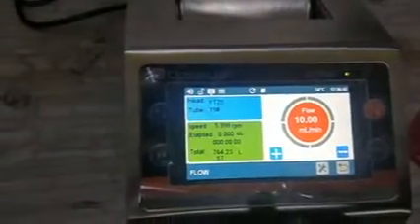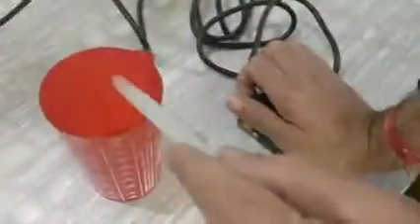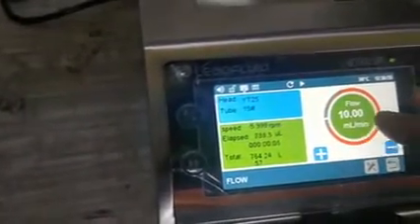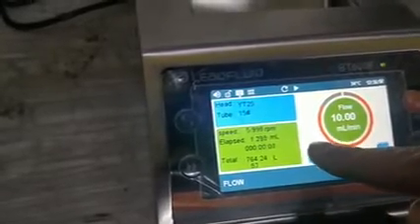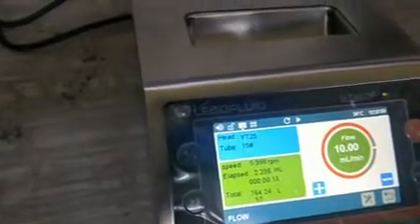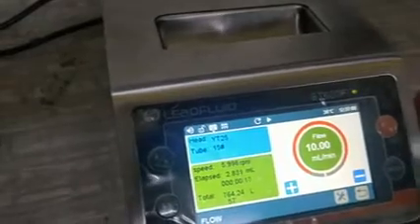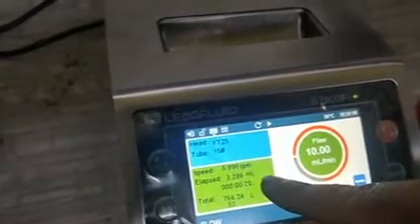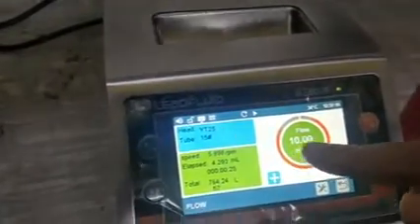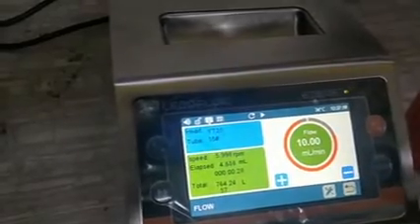The pump will keep running in Flow Mode until you press and release the foot switch again — at which point it stops. When you start the pump, you can see the dispense volume accumulating. If your volumes are not fixed, you can use the foot switch to manually control collection: after 4 mL press it to stop, then collect 5 mL next time — all controlled with the foot switch.